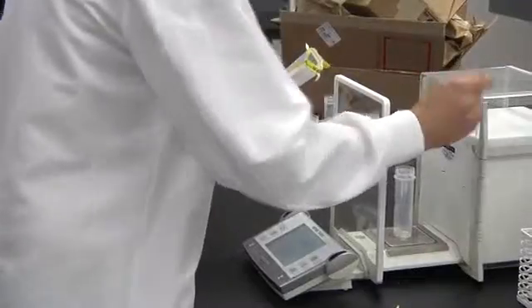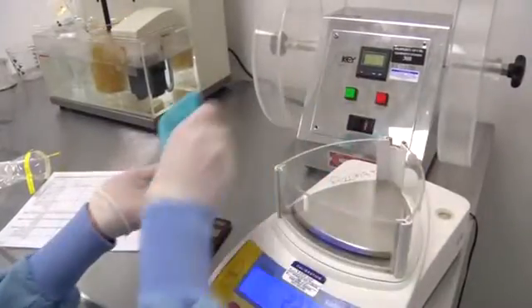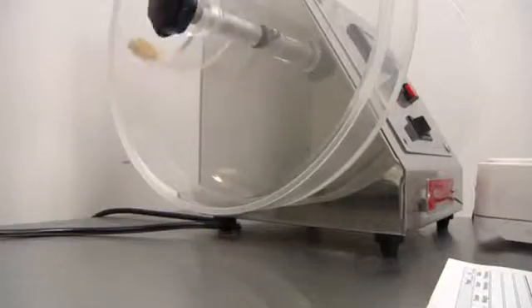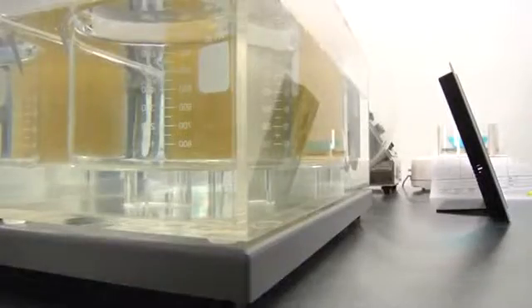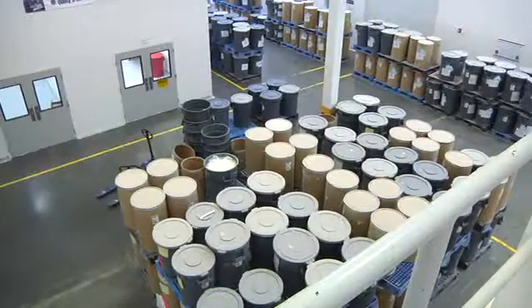After production, the finished tablets go through the same rigorous tests as the raw materials. After tablets pass the micro labs, we then perform such tests as friability and disintegration, as you see here. After all lab work is done, we begin preparations for production.